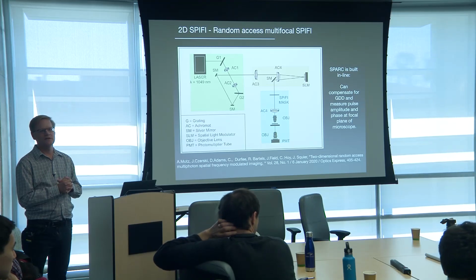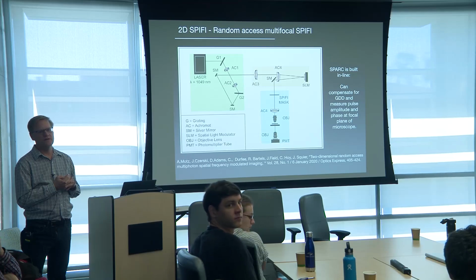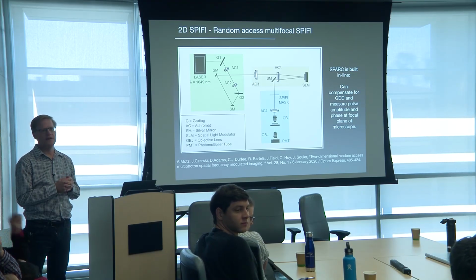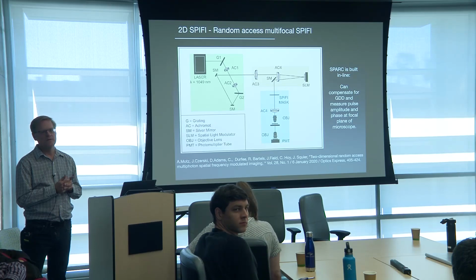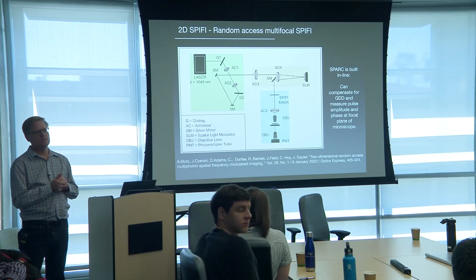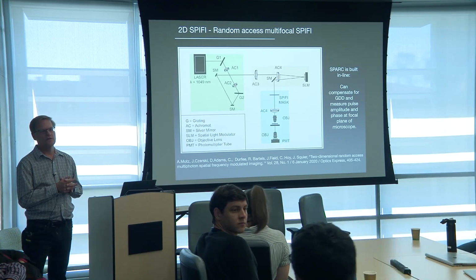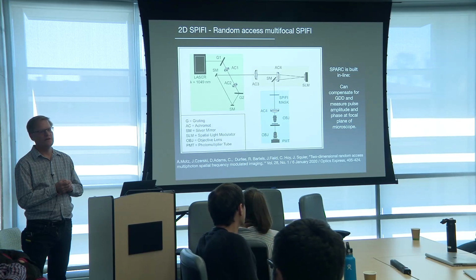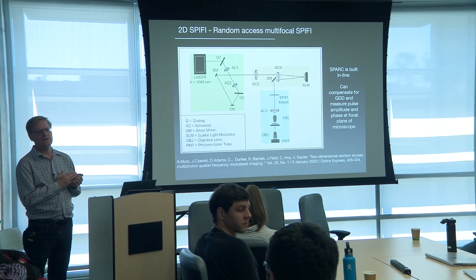Nico mentioned that the enhanced resolution is similar in principle to patterned, structured illumination. It's one way and back. You don't have to illuminate from the other side. Exactly, it should work better in scattering tissue. There are relatively few techniques that work well in scattering tissue for super resolution. That's the hope. A really powerful demonstration of that would be fantastic.